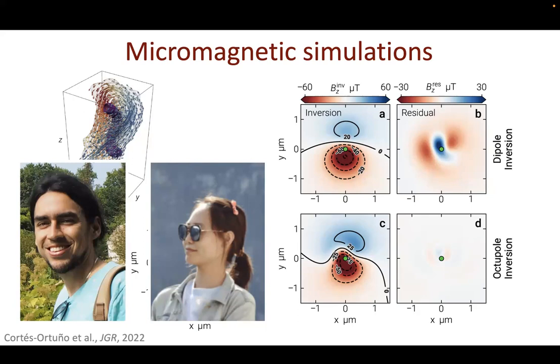We're working with people in Zurich, and they had the brilliant idea to put an NV center in the tip of an AFM probe. The main reason why you cannot get below this 1 micron resolution with your wide field QDM is because of the diffraction limit. We're working with light, fluorescence light, that has a wavelength of about 600 to 800 nanometers. So you cannot go down that really far. It's a diffraction limit of the system.